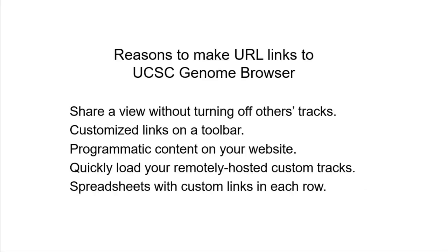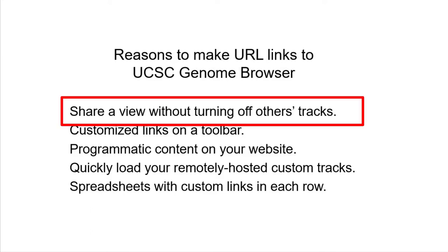There are many reasons you might want to make links by direct URL. If you simply want to share a link with a colleague that shows some location with certain tracks turned on, you can quickly construct it directly in the URL. It's fairly simple and does not make a permanent record in your saved sessions.